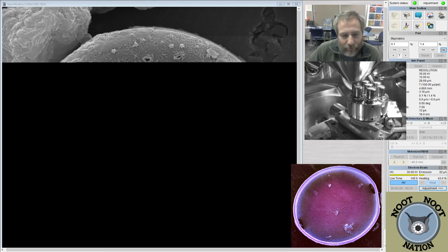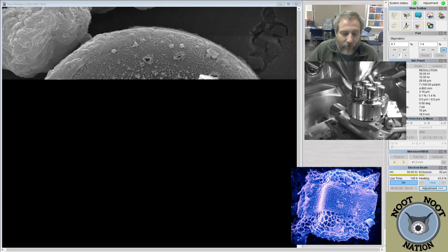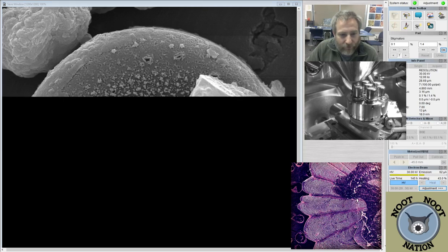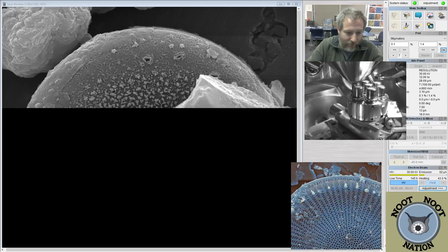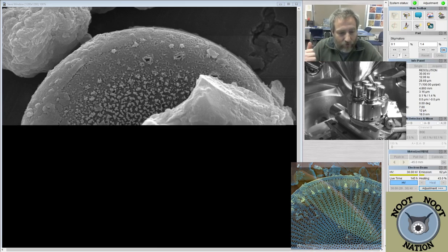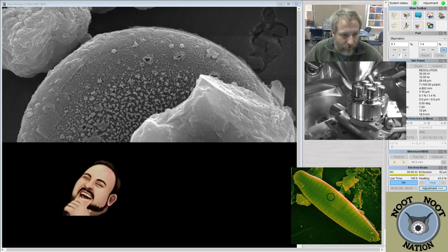We're looking at diatoms. These are diatoms from the Wabash River. Earlier I mentioned that these were collected from a sediment core and that normally you can't core river systems, but in this case a train has fallen into the river maybe 80 years ago or something, and one of the train cars basically was left in the bottom of the river. And so on the lee side, the downwater side of it, sediments can accumulate and they can't be really eroded very easily because of the train car blocking the water. So now the train's completely buried under sediment, and we collected a core from the back side of it, which is kind of interesting.